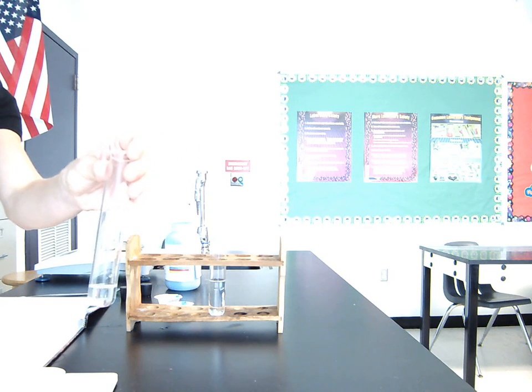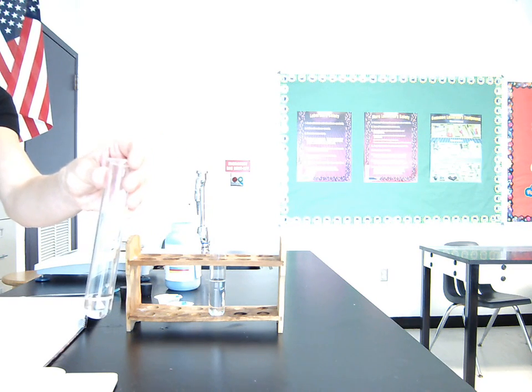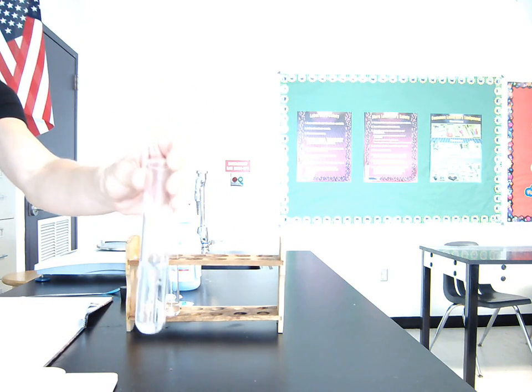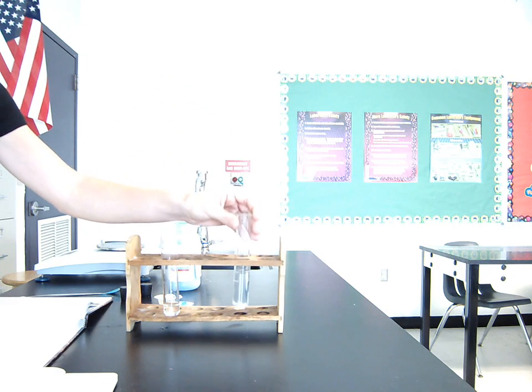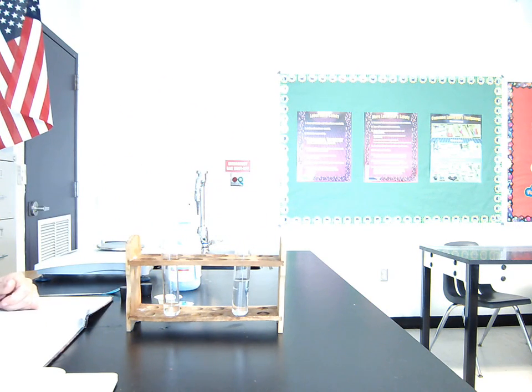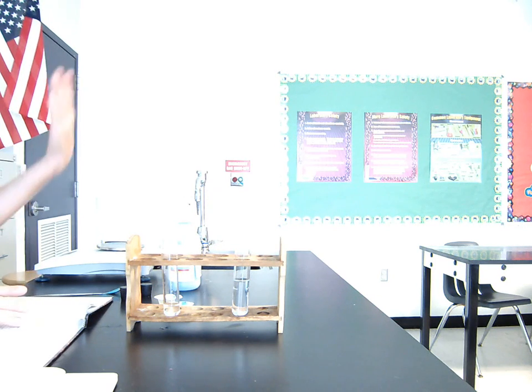So what we're going to do is start off with a test tube with 5 cubic centimeters of water in one, and then a second test tube with 20 cubic centimeters of water. Obviously a significantly larger amount of water in the second test tube. So our solute, we're going to take a solid and put it into the liquid and let it dissolve.